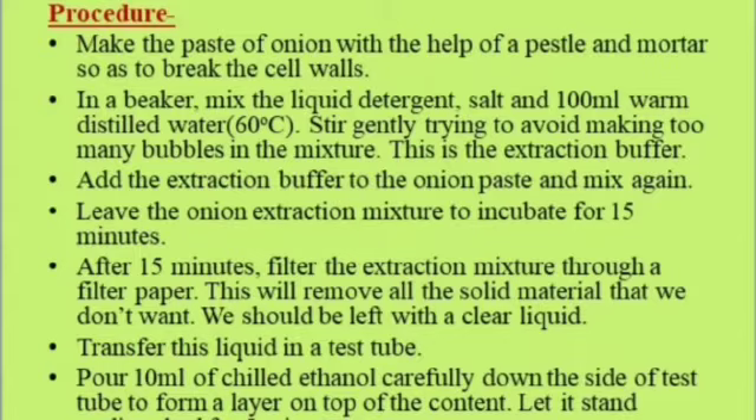Procedure: Make the paste of onion using a pestle and mortar to break the cell walls. In a beaker, mix the liquid detergent, salt, and 100 ml warm distilled water, stirring gently to avoid too many bubbles — this is the extraction buffer. Add the extraction buffer to the onion paste and mix again. Leave the onion extraction mixture to incubate for 15 minutes. After 15 minutes, filter the extraction mixture through filter paper to remove all solid material, leaving a clear liquid. Transfer this liquid into a test tube and pour 10 ml of ethanol carefully down the side to form a layer on top.